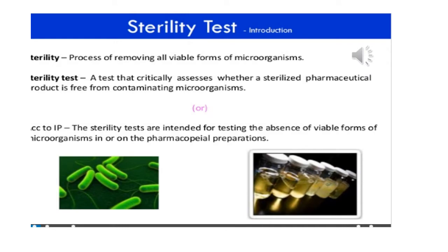Hello all, today we are going to discuss about sterility test. Sterility means a process by which you remove all the microorganisms from a pharmaceutical product. Sterility test is basically a test that critically assesses whether a sterilized pharmaceutical product is free from contaminating microorganisms. According to IP, the sterility tests are intended for testing the absence of viable forms of microorganisms in or on the pharmaceutical preparations.